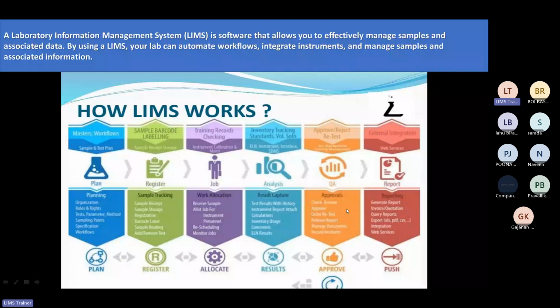Let's take one example, the HPLC columns. In the software, we have made each and every entry, whichever column you have received into the laboratory, and whichever you have destroyed. All the entries are there. So by just one click, one can understand how much inventory is currently available.